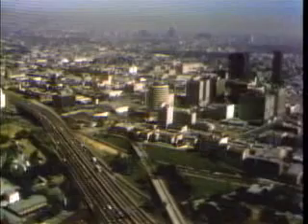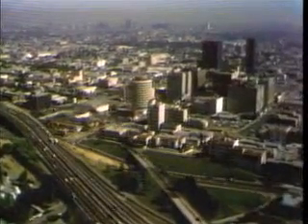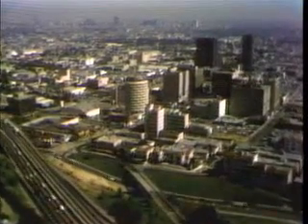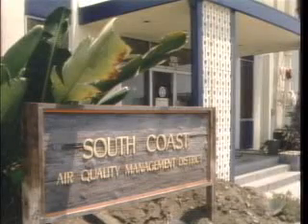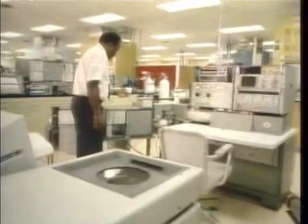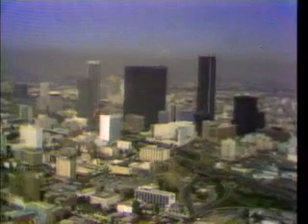Air quality and the composition of pollutants plague major metropolitan areas. For example, in Los Angeles, the South Coast Air Quality Management District monitors total hydrocarbons, ozone levels, carbon monoxide levels, and other compounds found in the air on a 24-hour basis. At the main air quality office, there are 10 gas chromatographs, and throughout the city there are 32 monitoring stations, all of which report their findings to the main station. By the use of gas chromatography, the Air Quality Management District can identify the sources of pollution and report on the quality of air the people of a city breathe.